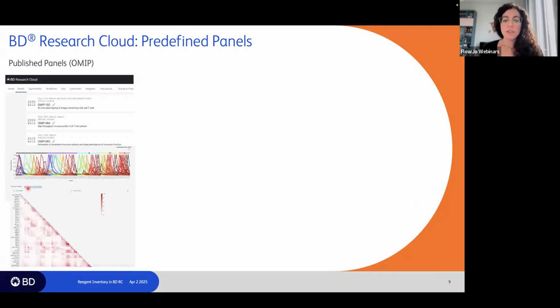Now, for those of you that are not familiar with this feature, we do have one specific webinar for the hotspot matrix in BDRC, but briefly, what it allows you to do is to understand which are the hotspots that could be causing unmixing errors.